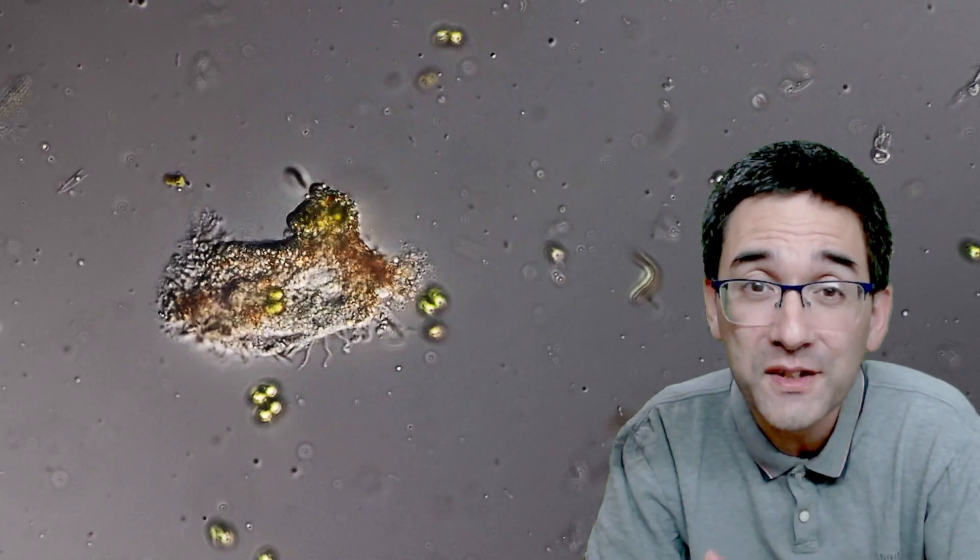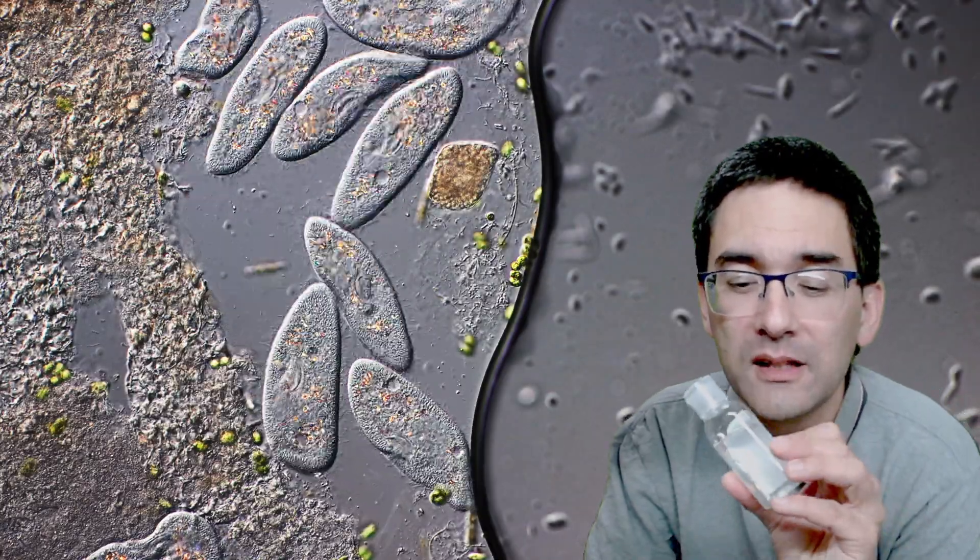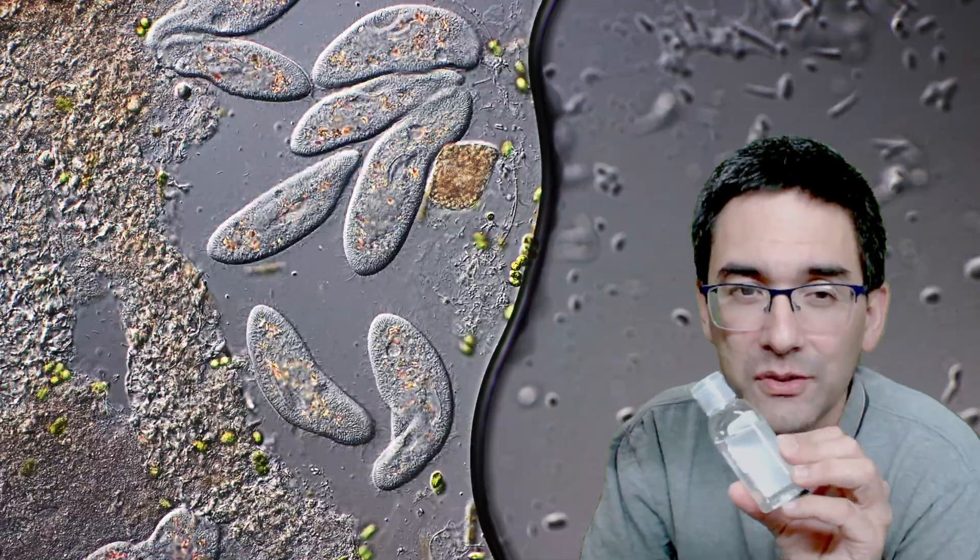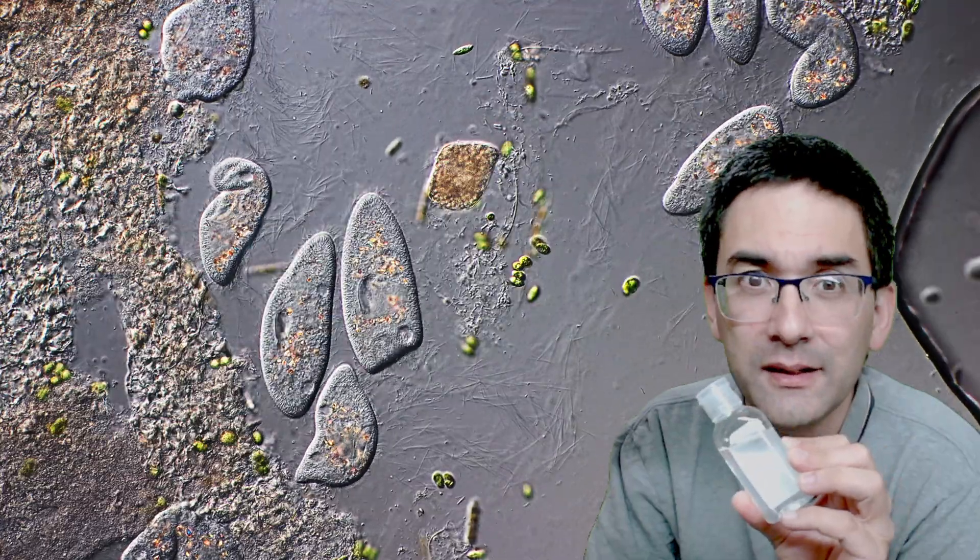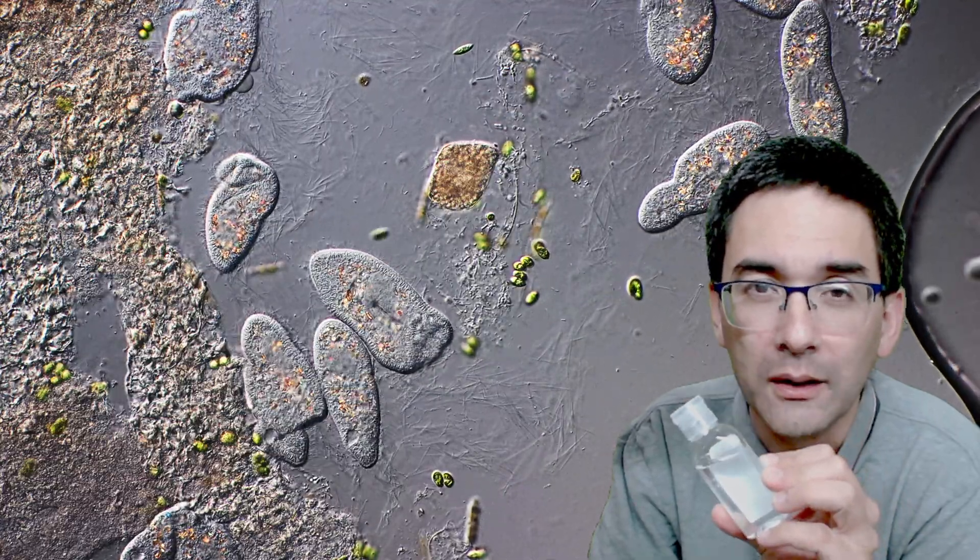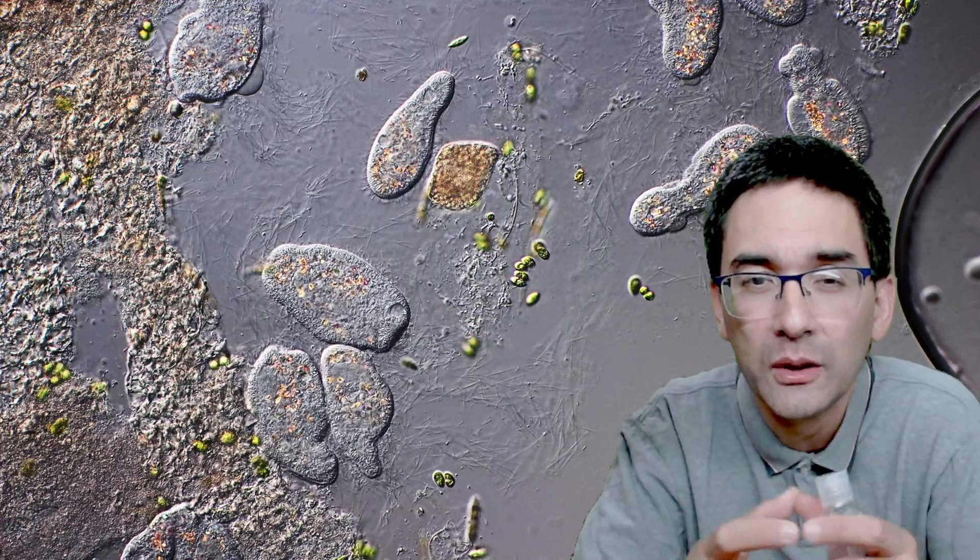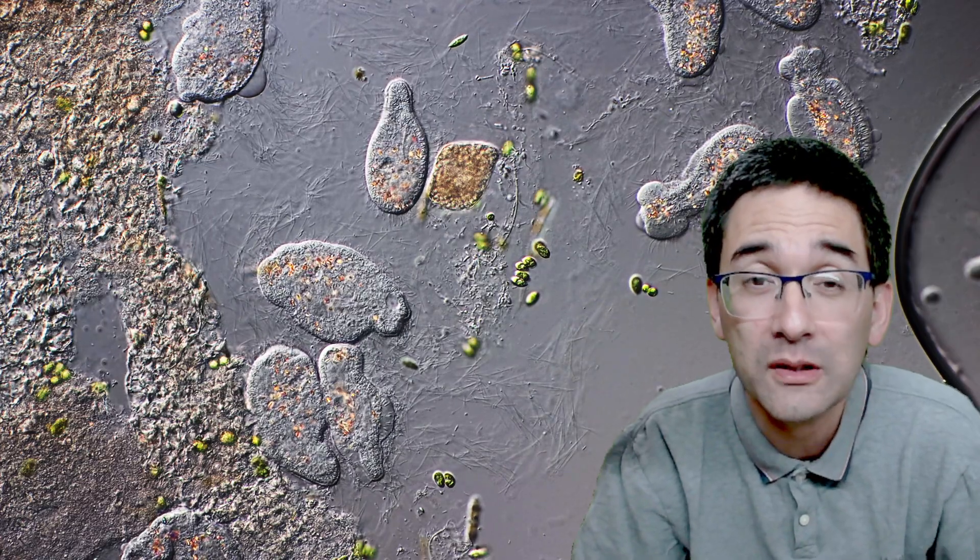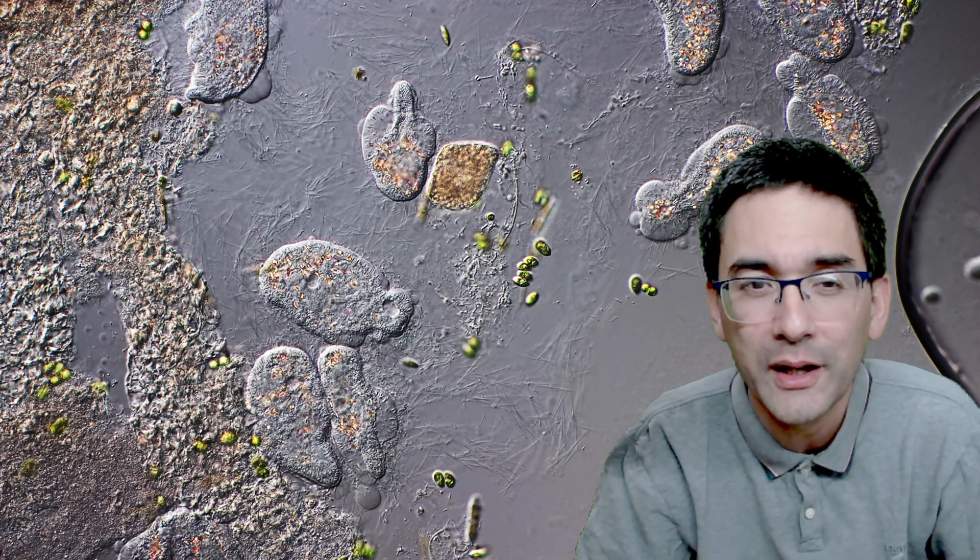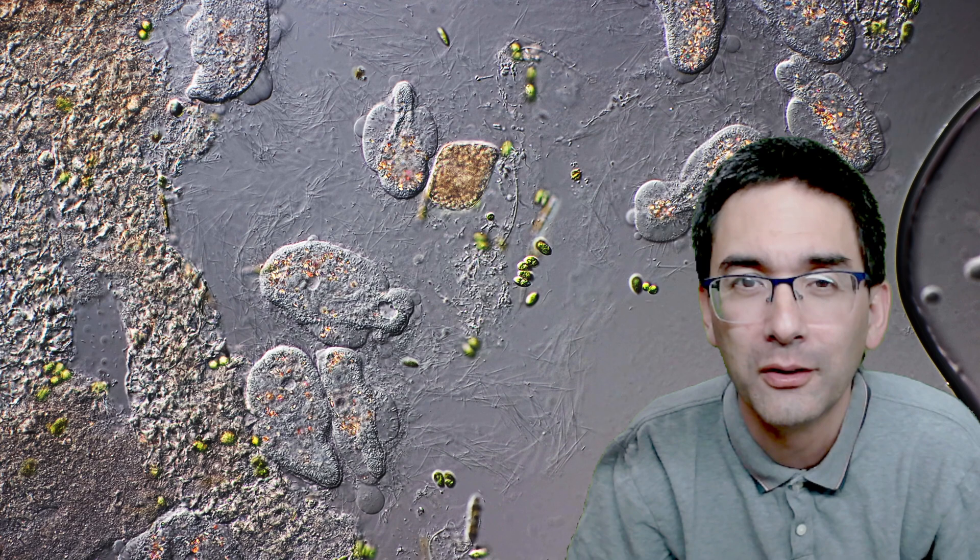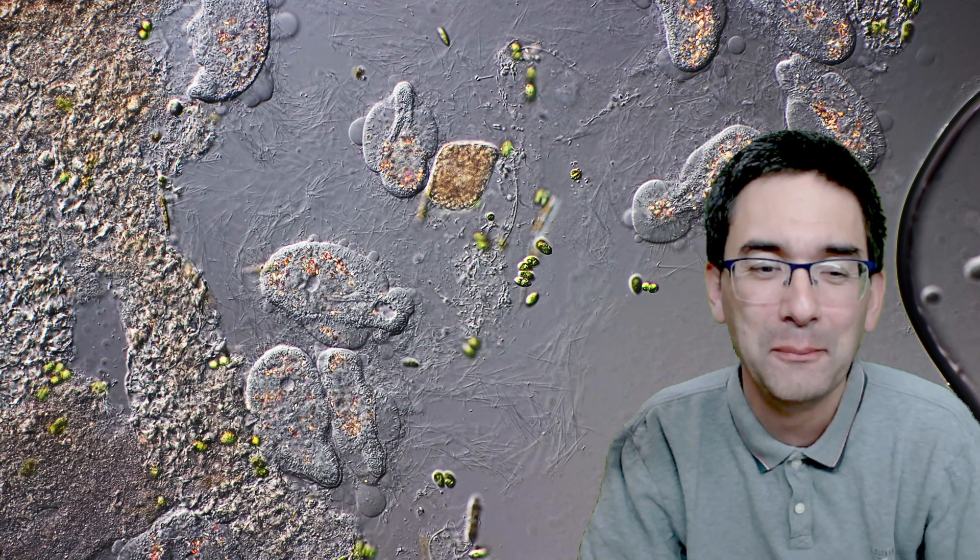Maybe you've seen one of my previous videos where I added this disinfectant to some paramecia. This clip here shows when I added this disinfectant—it contains alcohol as well. This alcohol will immediately rip away the cell membrane, dissolve it, and the cells will pop open. You can see the effect is quite fast and rapid. There's not much left over of the cells. It's a pretty sad sight, actually.